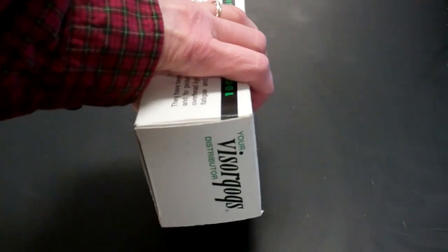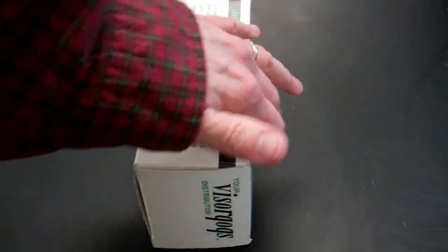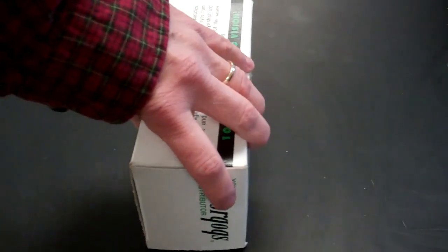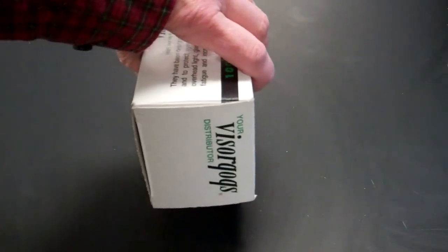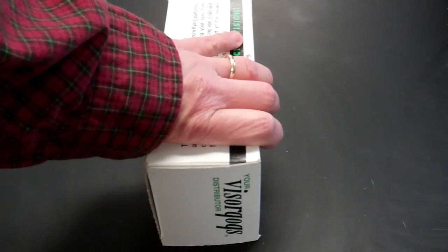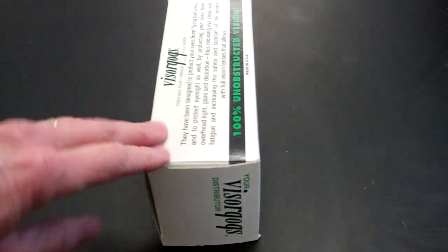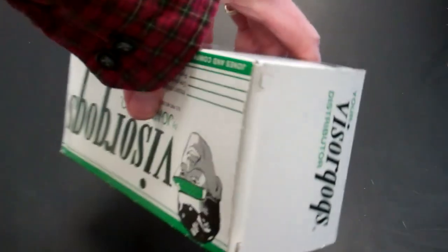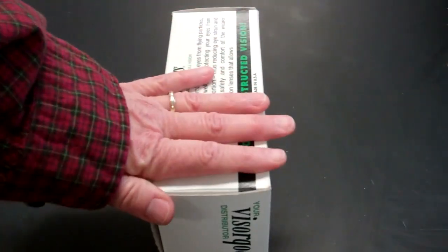Let's say that this is your cell. This outer part would be the cell wall. In real life, your cells really are three-dimensional that you're looking at, the Elodea cells. They look pretty flat on the microscope. But this really is the shape of your Elodea cell.